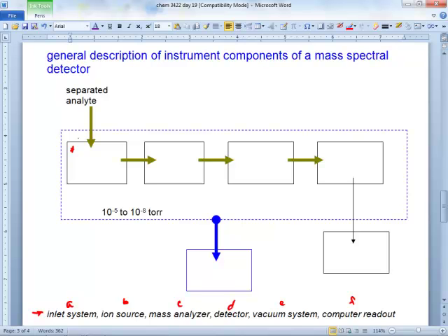You have to get your analyte from where to where? From here to here. A physical macroscopic distance. You have to get a gas molecule to go that far. If there's anything in there, especially this stuff, there's no way it's going to get there, right? It's called mean free path, the average distance between collisions. It's got to be literally a meter long before it collides with anything.